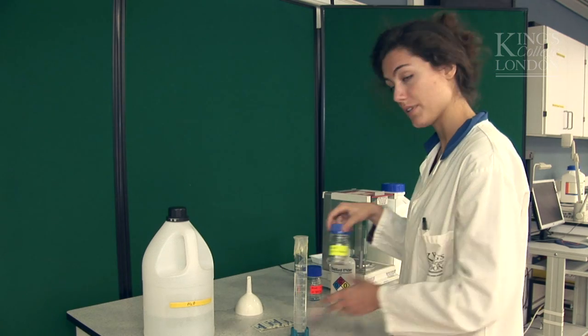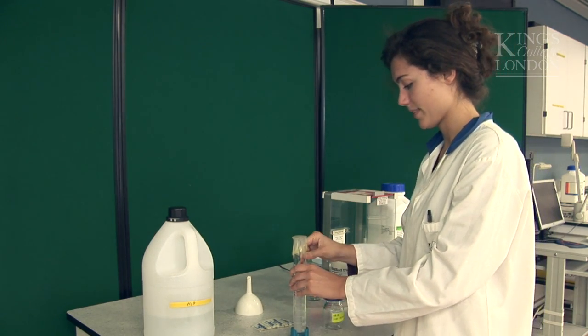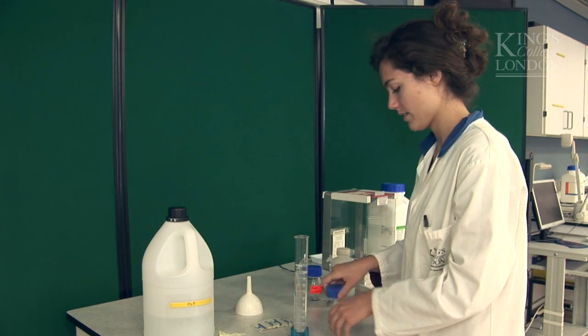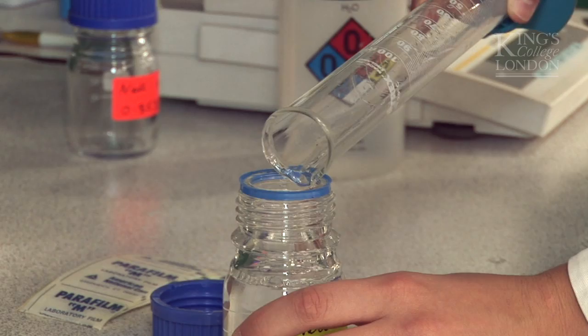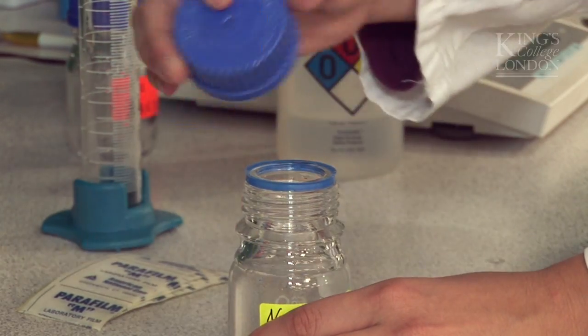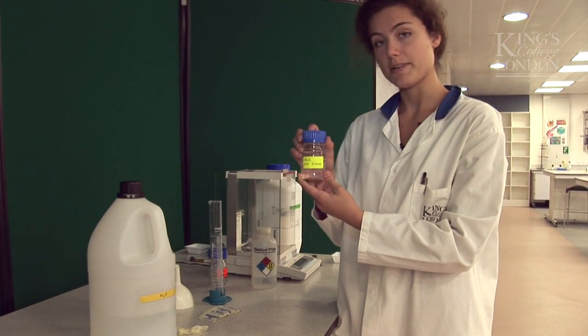So now I can put it into my bottle labeled stock solution. Let's remove the parafilm. Here we go. So my stock is ready.